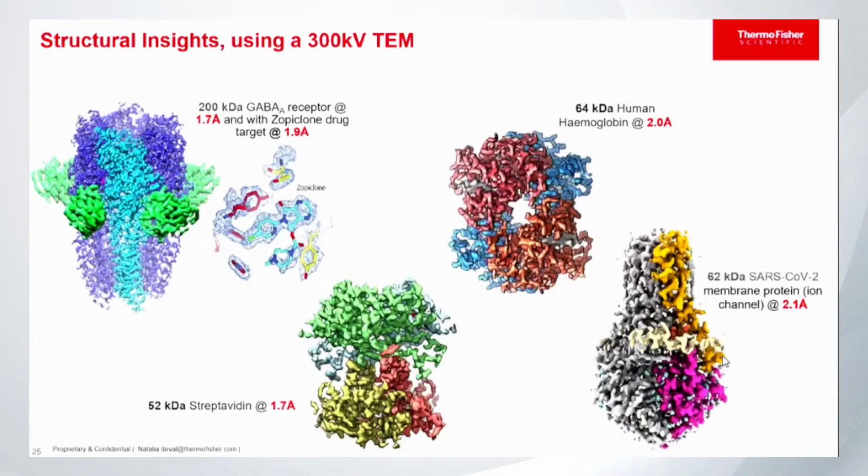Yes, that's the 3D reconstruction map. When you are doing the 3D map computationally, you always have that. You can see the side chains of the protein, the beta sheets sometimes, or the alpha helices, and you will always see that this connection is the way it is.